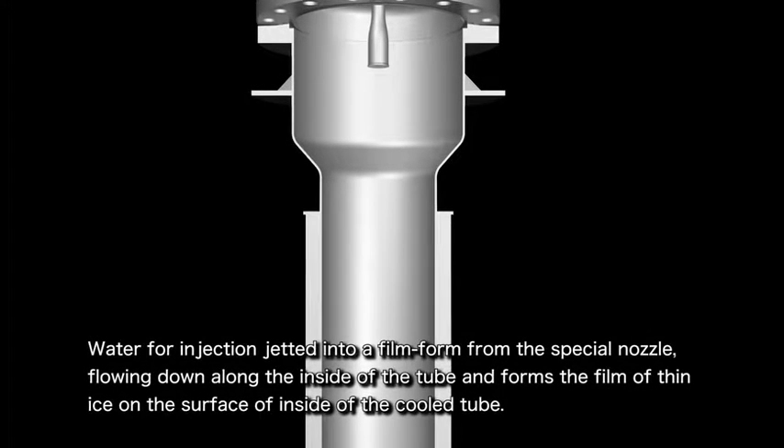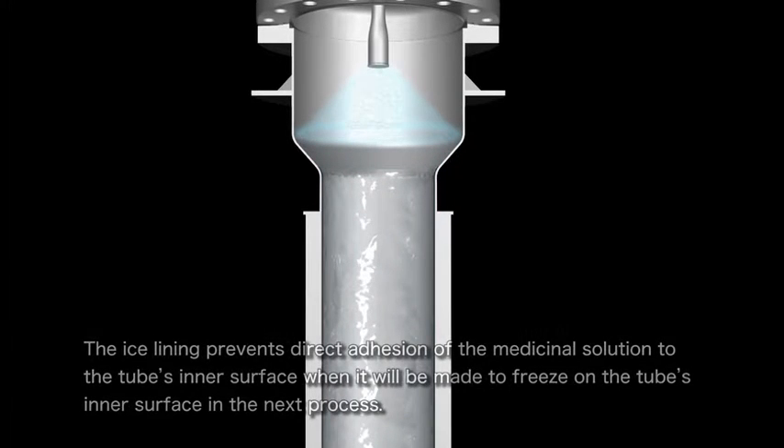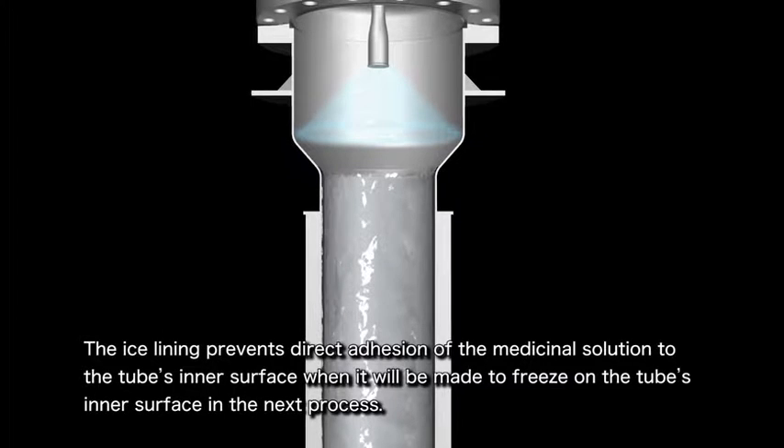Let's look at this enlarged image and take a closer look at the tube. After having been sent through a special nozzle in a manner to form a thin film, the liquid for injection will run down along the tube's inner surface. It eventually forms a thin ice film on the cooled surface inside the tube. The ice lining prevents direct adhesion of the medicinal solution to the tube's inner surface.